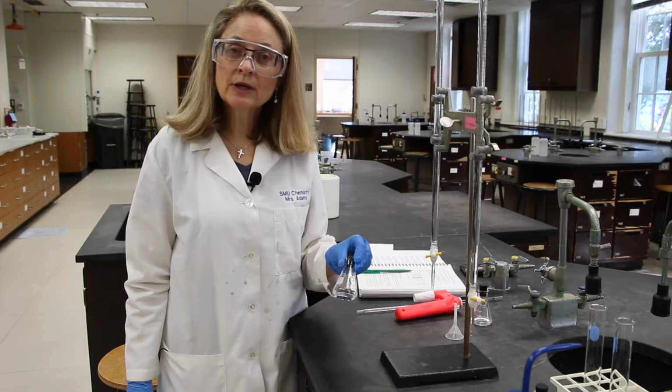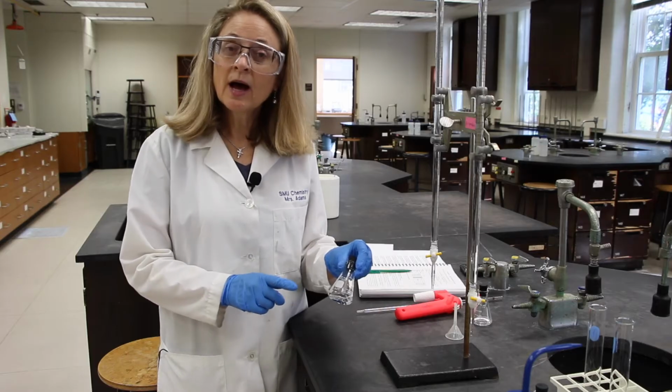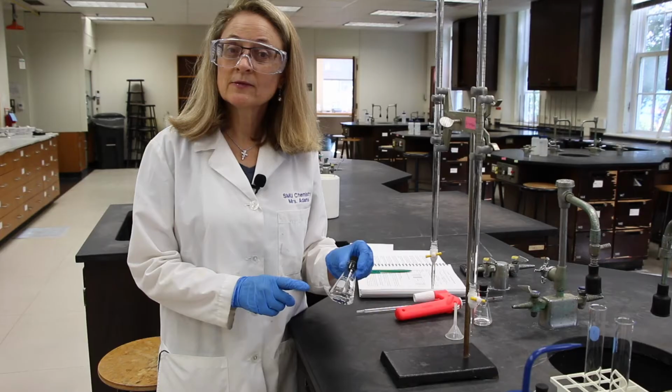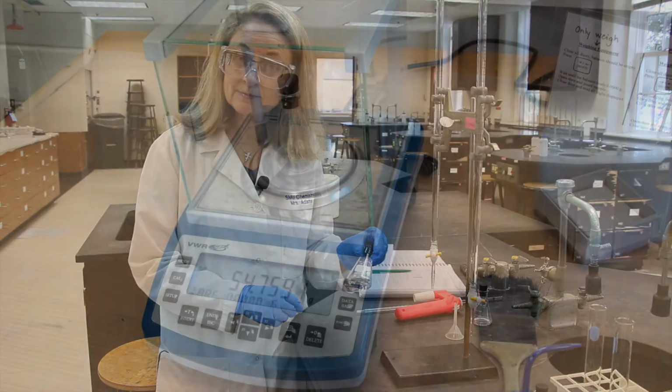Next, we need to reweigh the mass of the sample, flask, and stopper. I'd like you to record this value and then enter it in the mass of sample and flask and stopper row in the 2-propanol column of your data sheet.